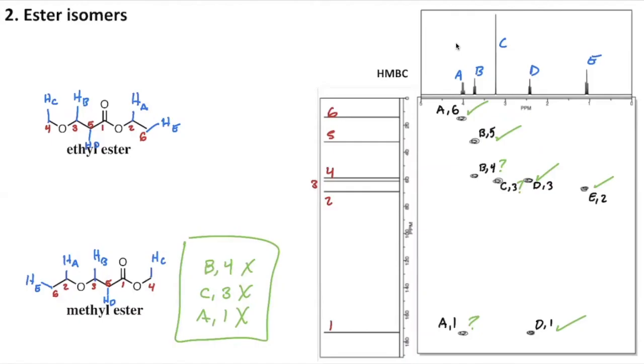So this, again, will not be required for your post-lab assignment, but there are a few practice problems that contain HMBC data that may be helpful for you to practice with. So stay tuned for the next two videos where we work through a full spectral assignment to take the pieces of one-dimensional NMR, COSY, and carbon-hydrogen HSQC analyses, bring them all together, and really dig through the data to give us a full assignment of carbon and hydrogens on molecules that are still relatively small, but more complex than the examples we've looked at so far. These will be great practice for your post-lab, as that's essentially what we're asking you to do for that assignment.